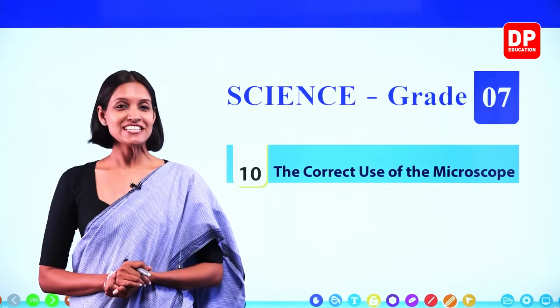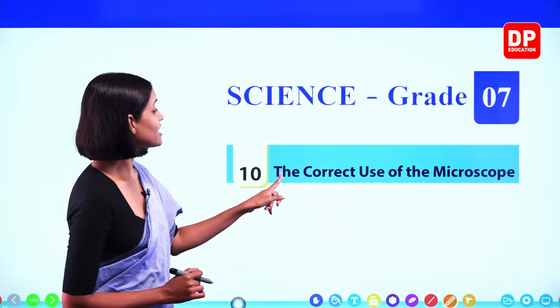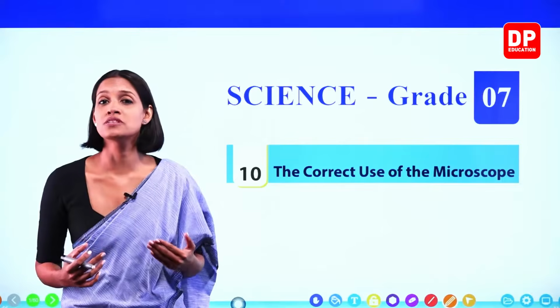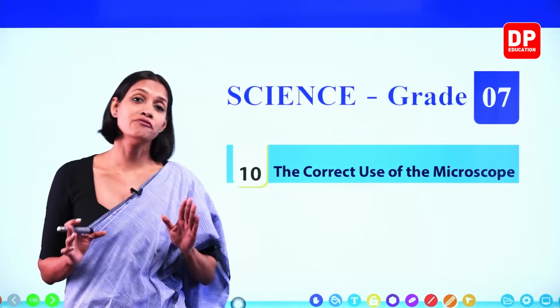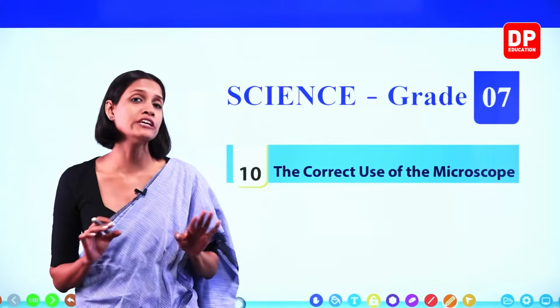Hello dear grade 7 children. Today we are going to learn the 10th lesson of the science textbook, that is, the correct use of the microscope. Now you have used the microscope last year to observe the microorganisms. Do you remember how we used that? You have not used it by yourselves, but your teachers must have taught you how to use the microscope briefly.